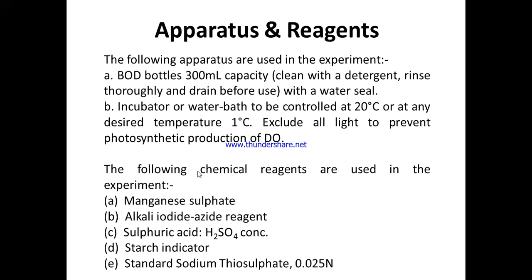And we will also require the following chemical reagents. Okay, we will require manganese sulfate. Okay, we will require alkali iodide azide. We will require concentrated H2SO4. We will need starch as an indicator, and we will need standard sodium thiosulfate. Okay, we will need standard sodium thiosulfate of 0.025 normality.